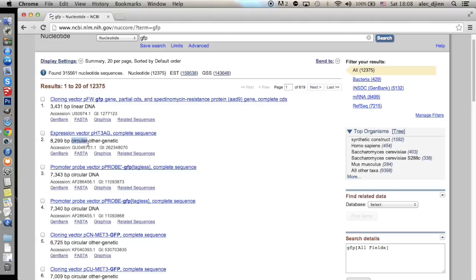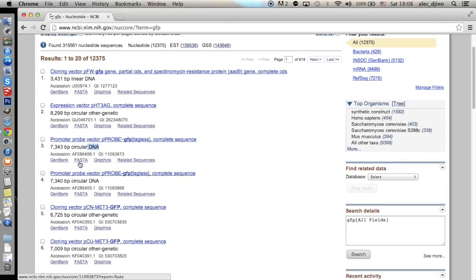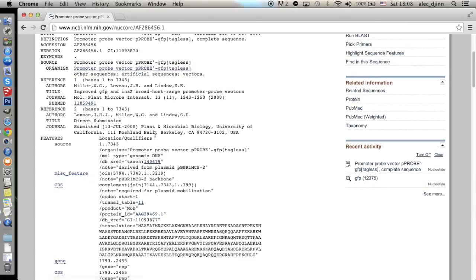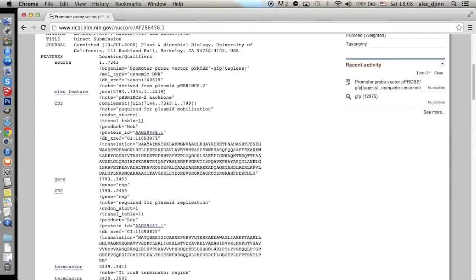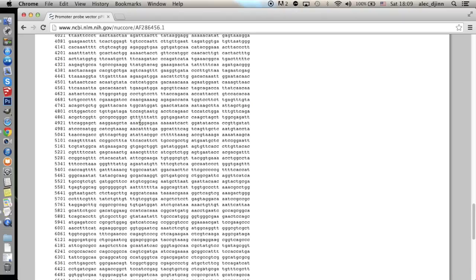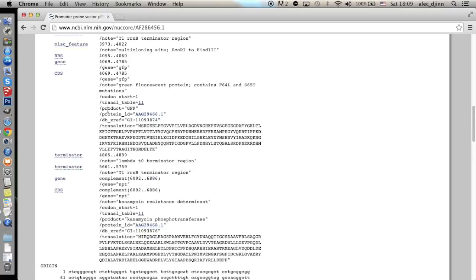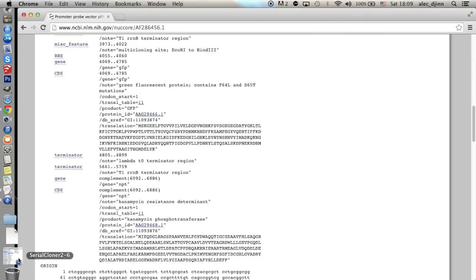Let's pick one to make a case study. This page contains all the information regarding the plasmid we just picked. The whole sequence is at the end of the document, while at the top we see other information, like the list of proteins coded for by the plasmid and various notes. If we search here, we find the lines that indicate the vector codes for GFP — exactly what we're looking for. Here we find the relevant indices to the coding sequence, and this is all we need to start.